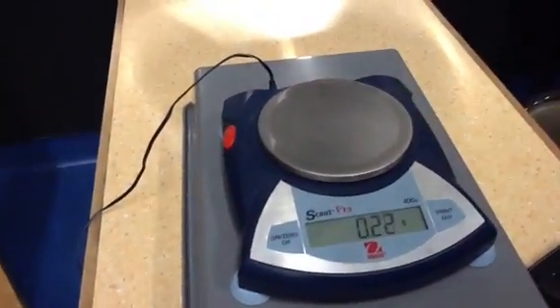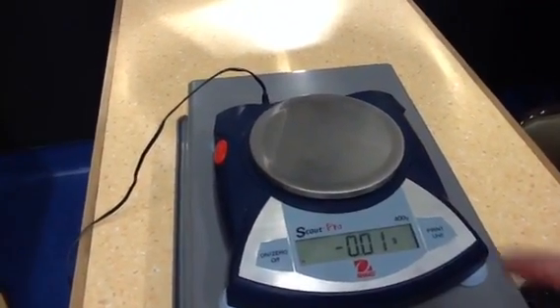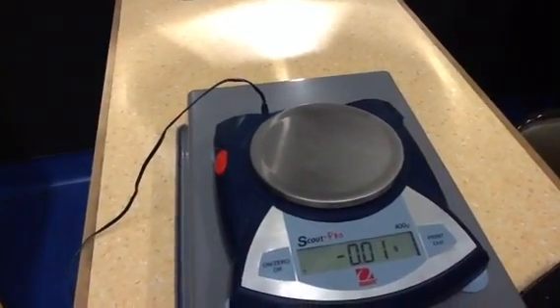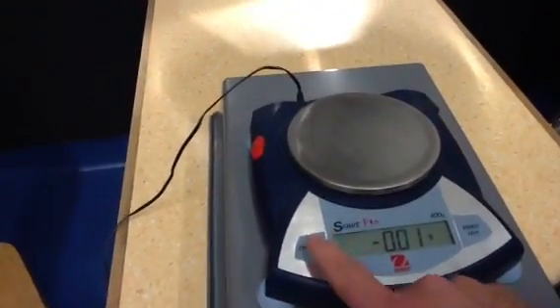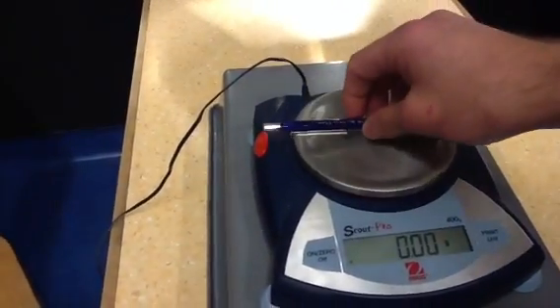I'll just take it off again and double check that it's reading zero when it should be zero. I might have actually bumped it when I dropped that on, which could actually cause an effect on the zero reading. So I'd re-zero it and just double check.